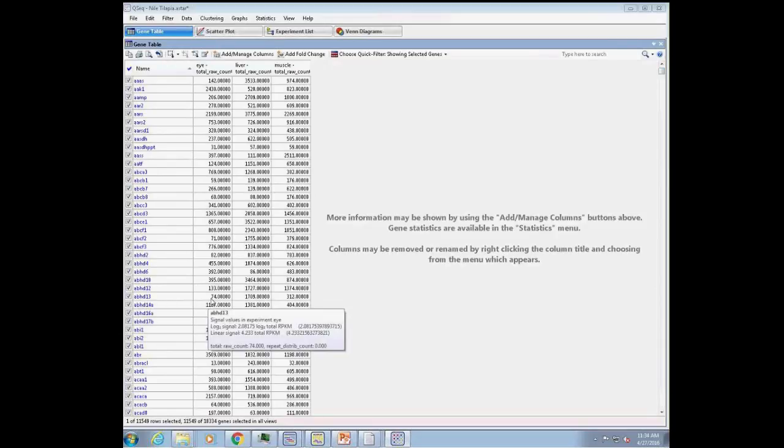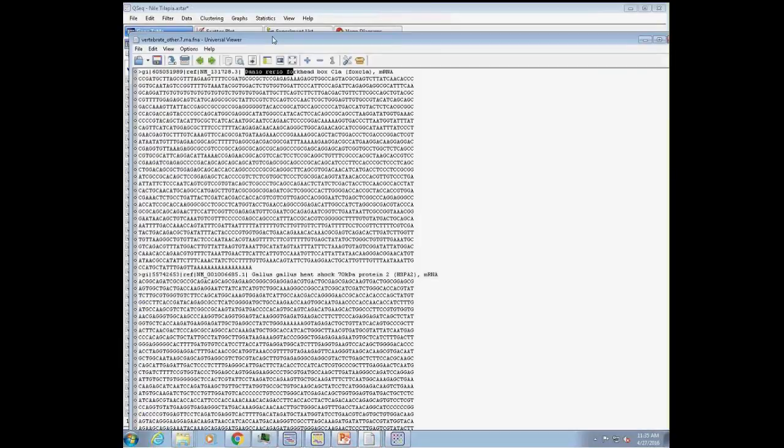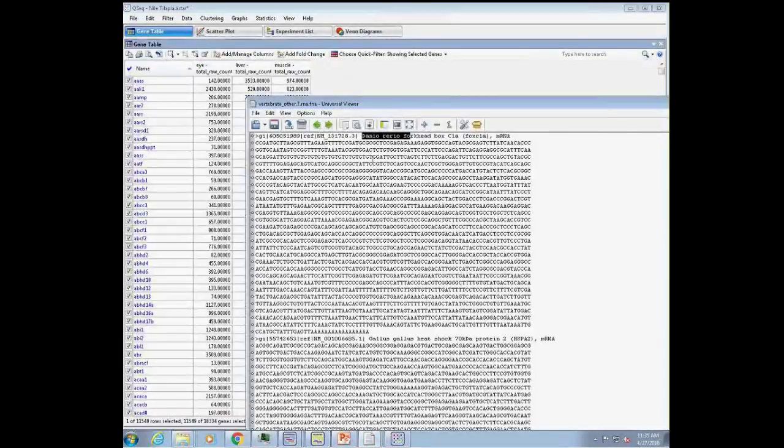Now, I can bring in more information as well. And this is, again, part that for a lot of you that have been working in this workflow already, it's a little piece of information that I can show you here. So if I want to bring in some of the other headers from the FASTA file, so when we look back at this, this is the original information from the GenBank file.